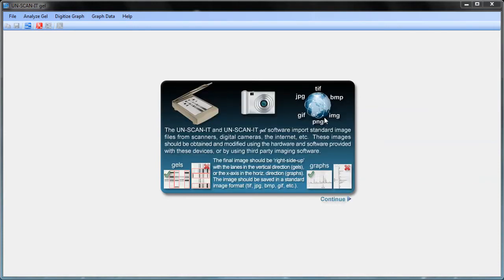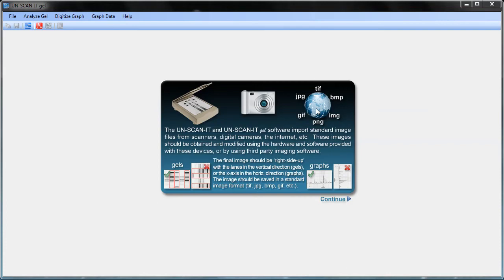The UnscanitGel software can analyze a variety of image formats including TIFF, JPEG, Bitmap, GIF, and PNG formats. The image can come from a scanner, digital camera, imager, internet, email, or other image source.